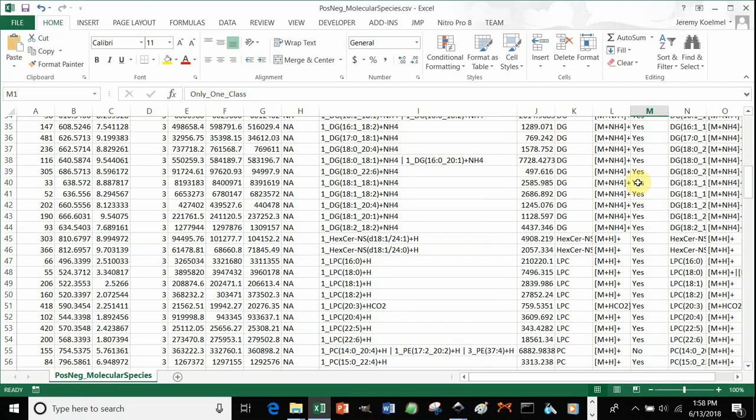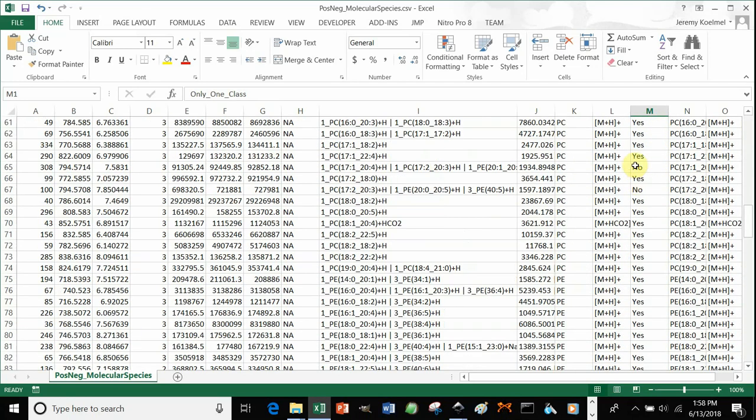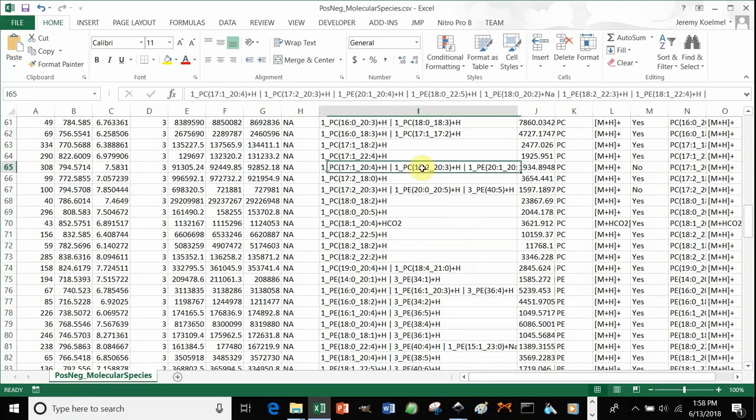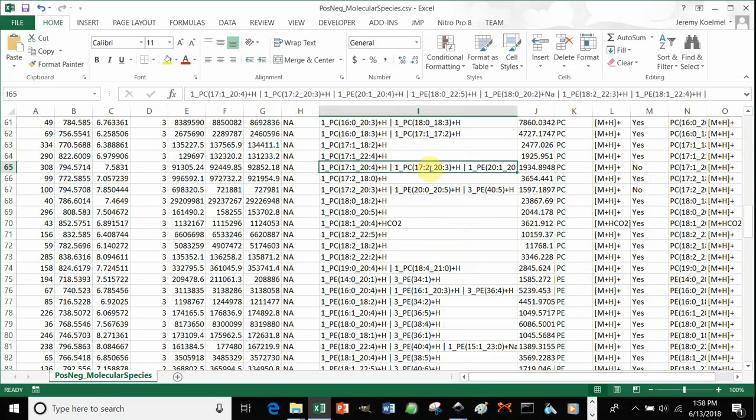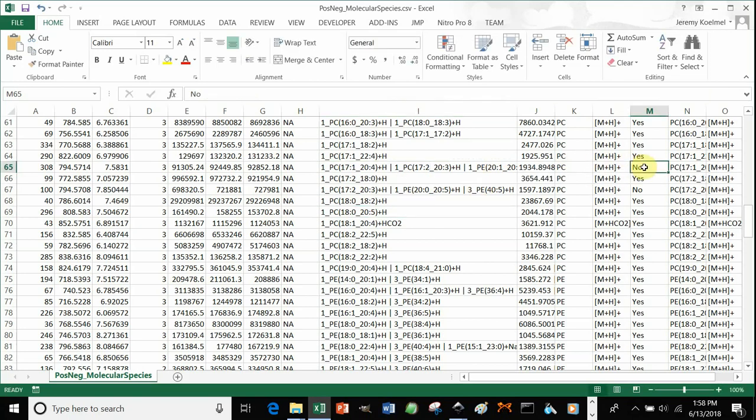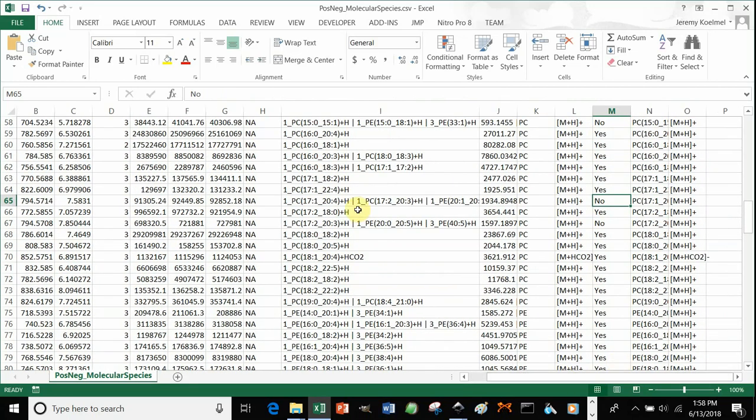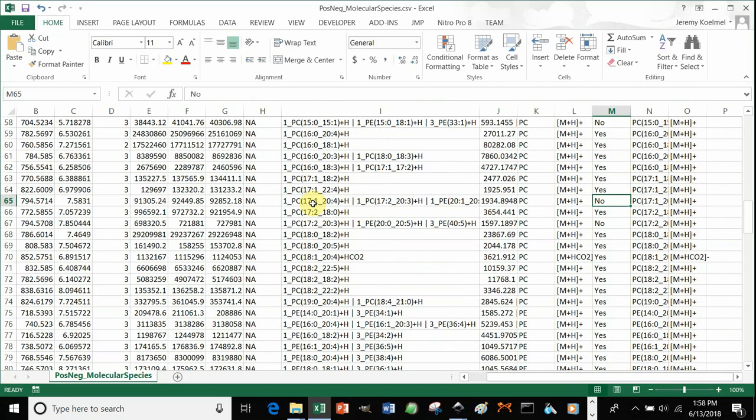So if we scroll down, in this case, we have PCs and PEs identified under the same feature. And so in this case, we can't discern which class adds up to the most dominant within that peak.